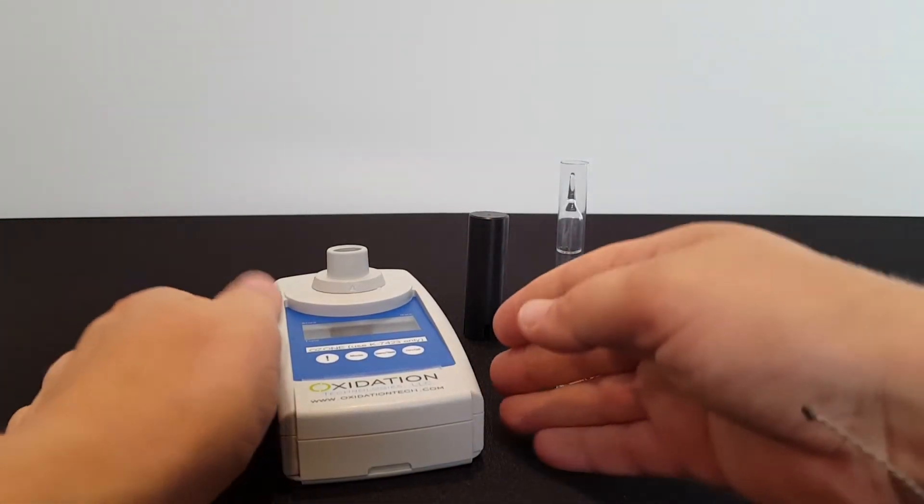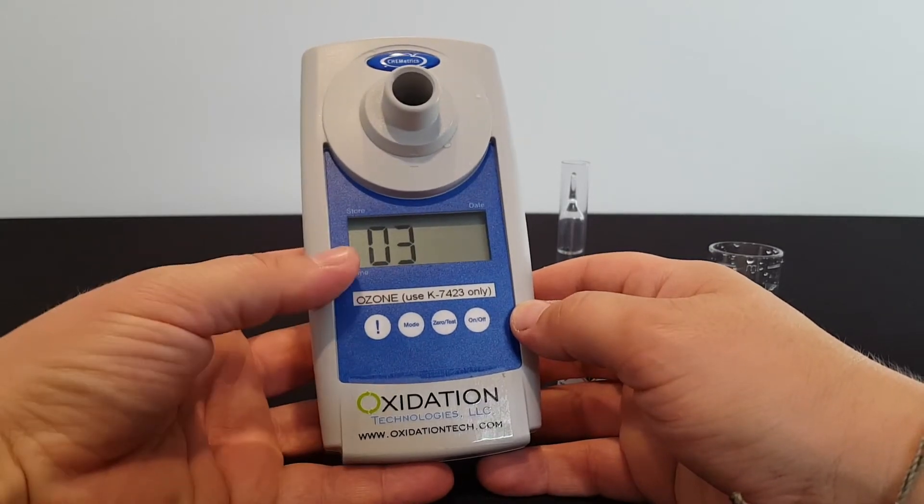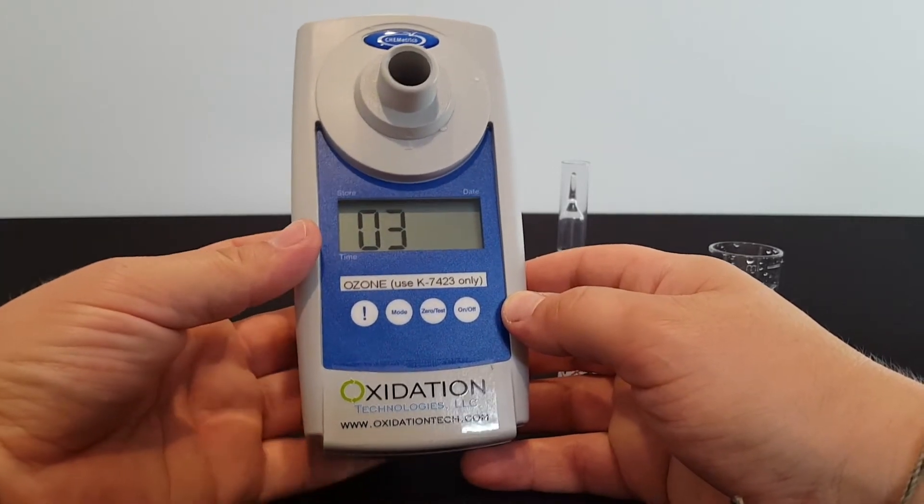So the first step is going to be zeroing the meter. We need to turn it on. When I turn it on, the O3 symbol appears.